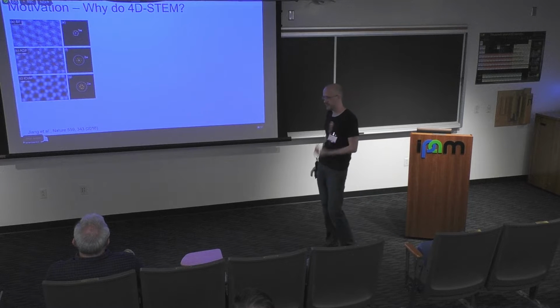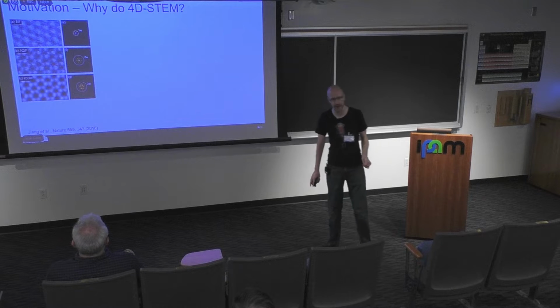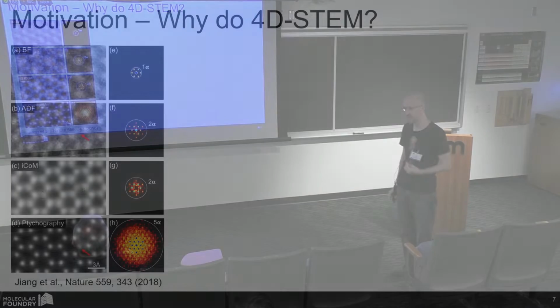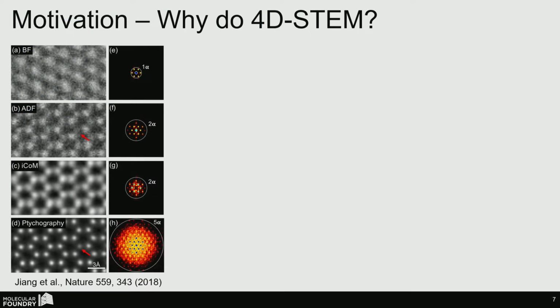But if we do what I mentioned in the previous slide, record a full diffraction pattern, and then do an algorithm called ptychography, we can get both the high signal-to-noise of phase contrast, but also dramatically boost the resolution. And in their most recent paper, the Cornell group has now gotten down to resolution about equal to the vibration of the atom, the sort of thermal envelope of the sample.